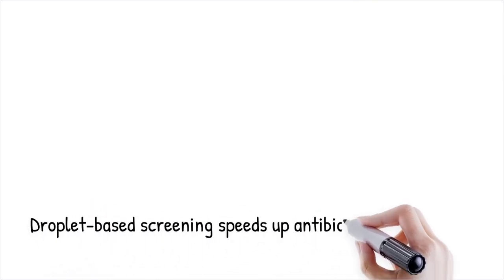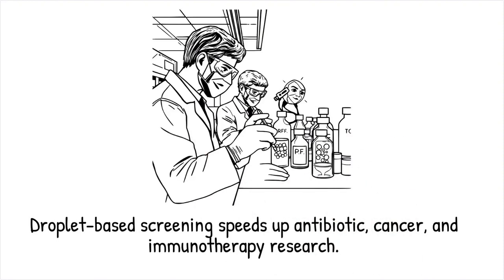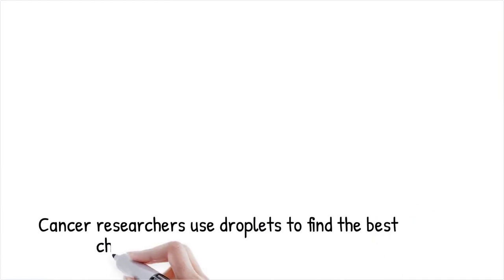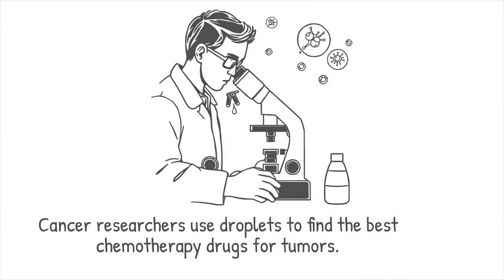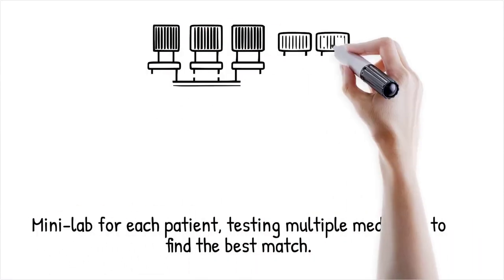Droplet-based drug screening accelerates antibiotic discovery, cancer therapy development, and immunotherapy research. Cancer researchers use droplet-based assays to test which chemotherapy drugs work best for a patient's tumor cells. It's like having a mini lab for each patient, testing multiple medicines at once to find the best match.